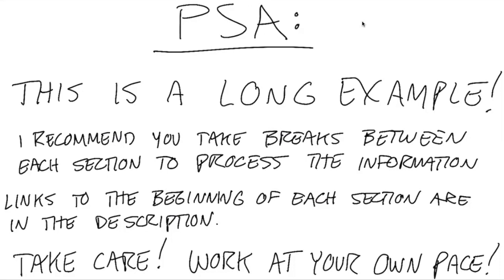I wanted to include pretty much everything that you need to know about one example in one video, but it turns out that takes a really long time. So I don't expect that you will approach the problem solving of working through these examples or your post lab in that same way. I expect that you should work on it over a course of days or weeks. That's why we gave you weeks to do it.